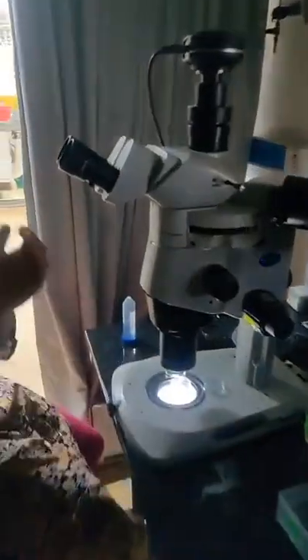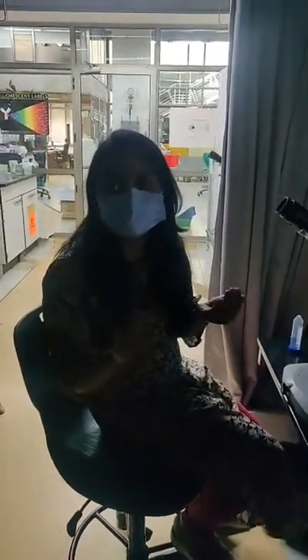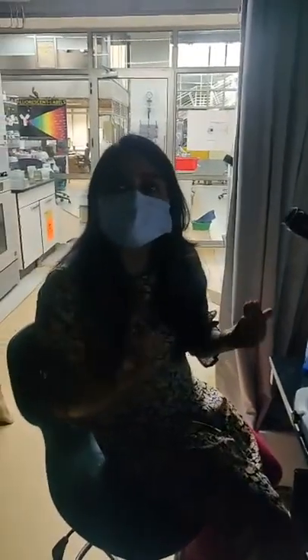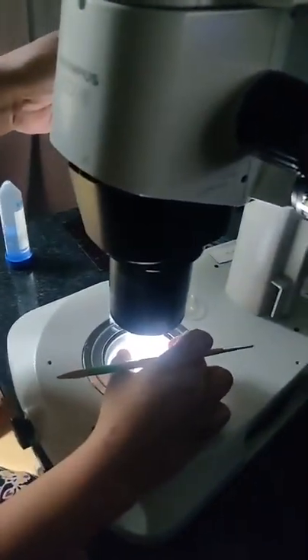To be able to do two things simultaneously, where we see the fish behaving, doing some form of movements, and also record what's happening in the brain, we have a different kind of preparation that I'll show you here. Here we have restrained the head of the fish.